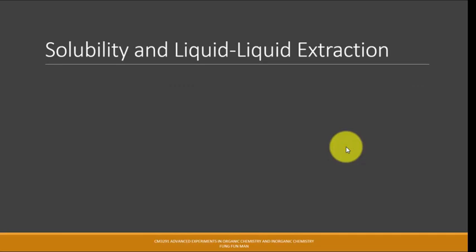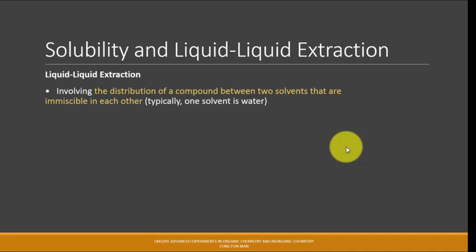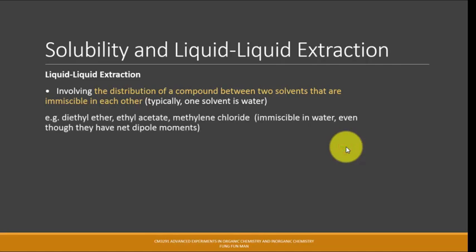For solubility and liquid extraction, just a bit of reminder. This involves the distribution of a compound between 2 solvents that are immiscible in each other, and typically we use one of them as water, the aqueous phase. Just like in this experiment, we use water and, recall, DCM? No, ethyl acetate. So some of these organic solvents are listed here: diethyl ether, DE, EA, DCM.